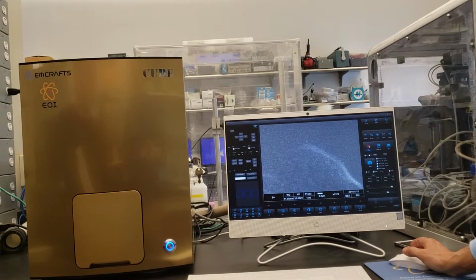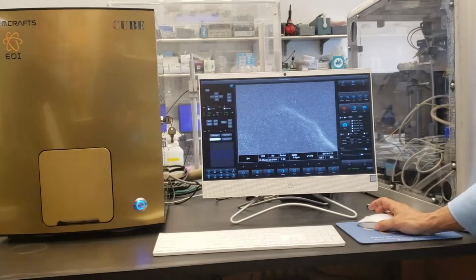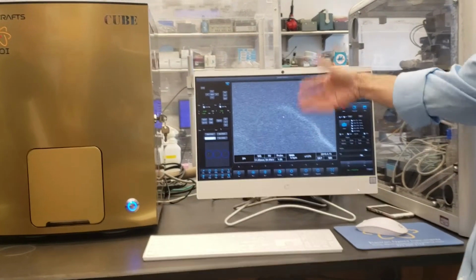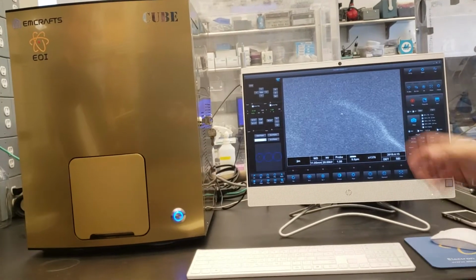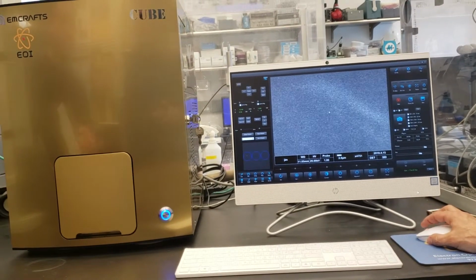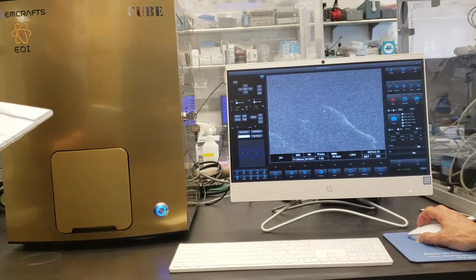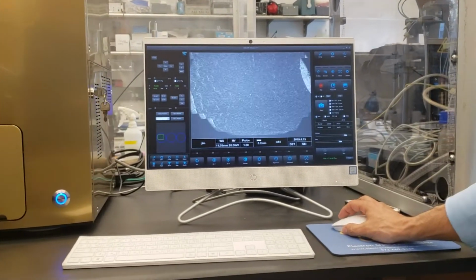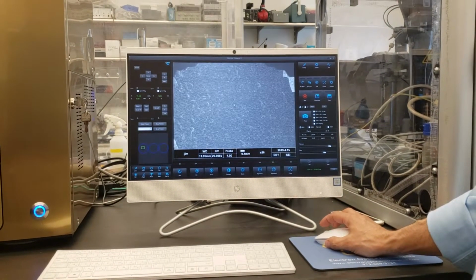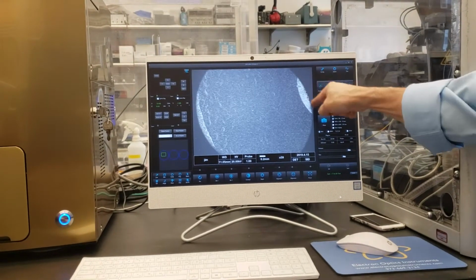Okay, beam is on right now. So now the beam is on. So what I'm going to do is, if I keep my mouse inside the SEM main operating window, and I use my trackball, if I go up or if I go down, see I'm just rolling my trackball right now? Yep, that's changing the magnification, right? And actually I see your grid. See your grid right there? See the corner of your grid, right?